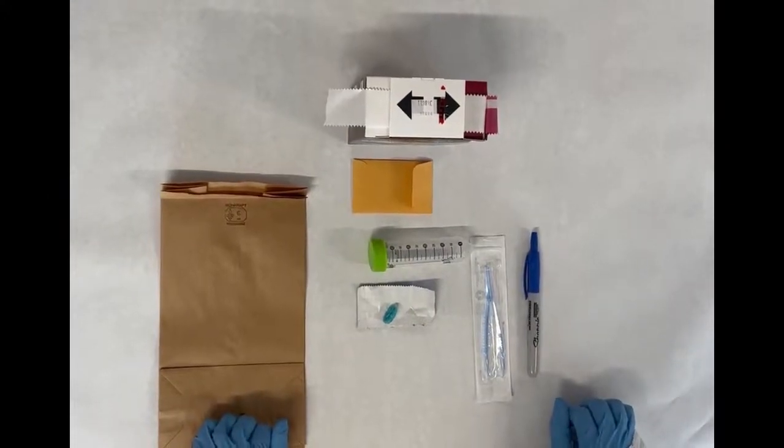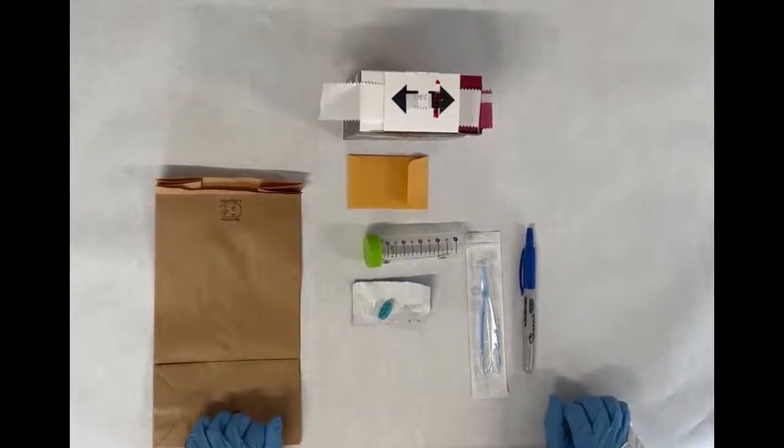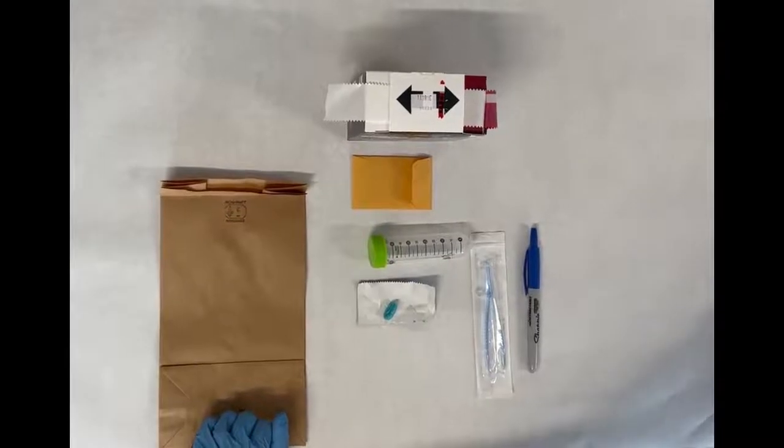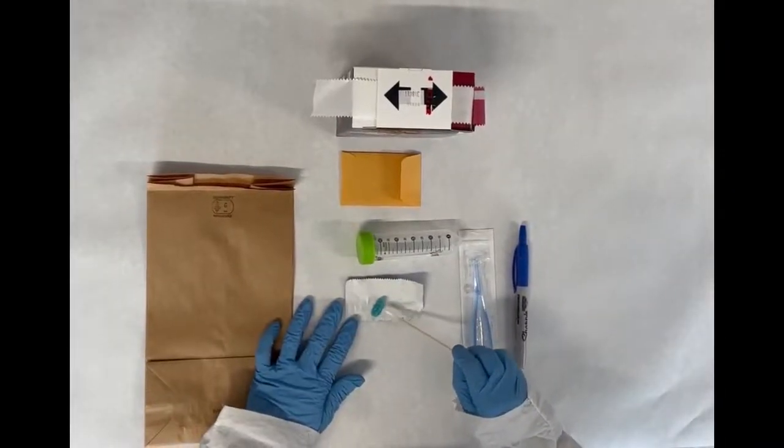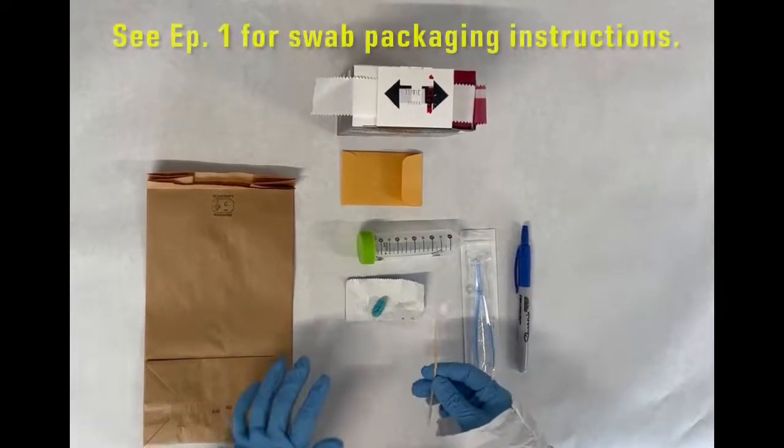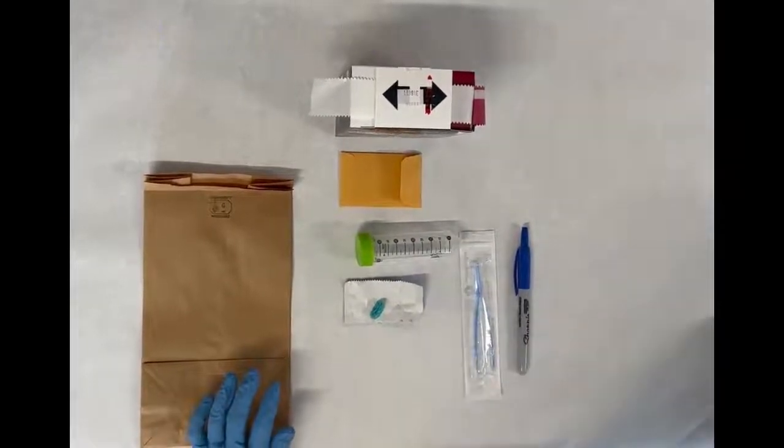So let's get started. If you have a used piece of gum at a crime scene that was left by the suspect, the best practice is for you to swab the entire surface for potential DNA and submit that swab to the lab for testing.